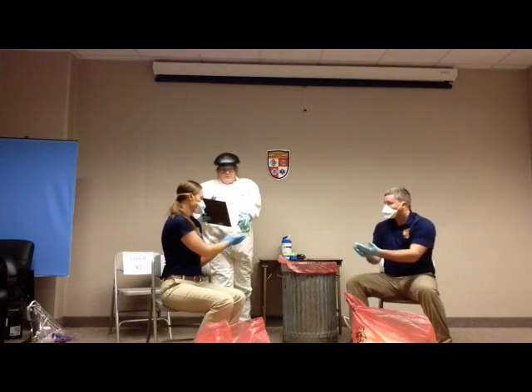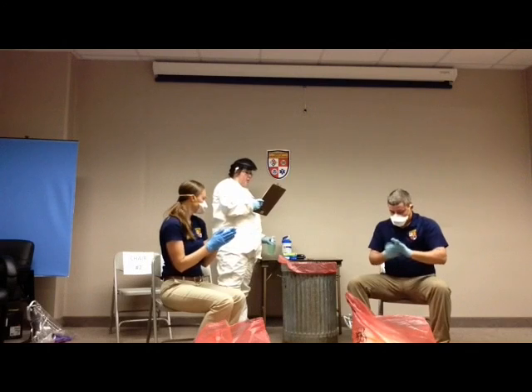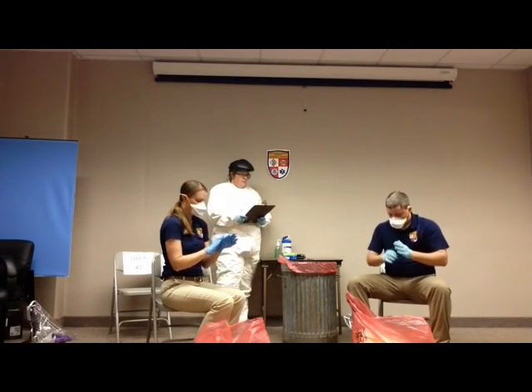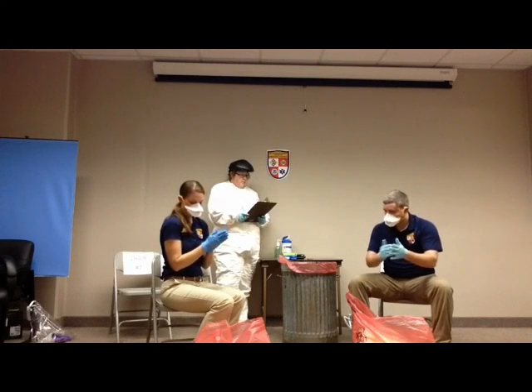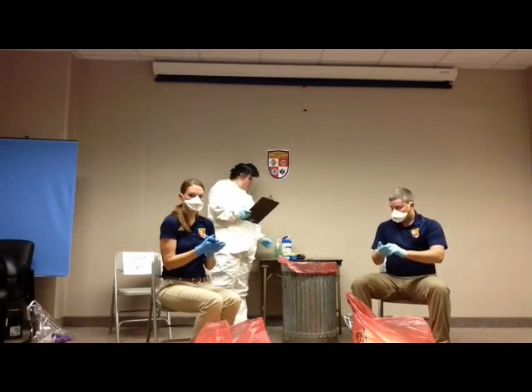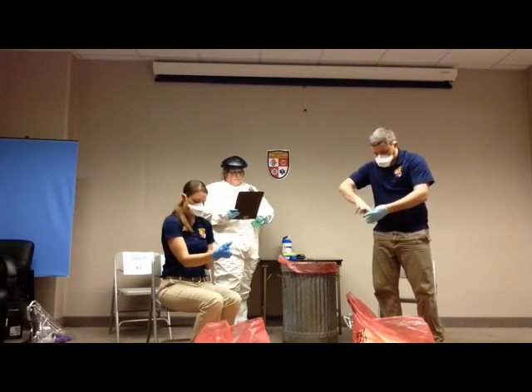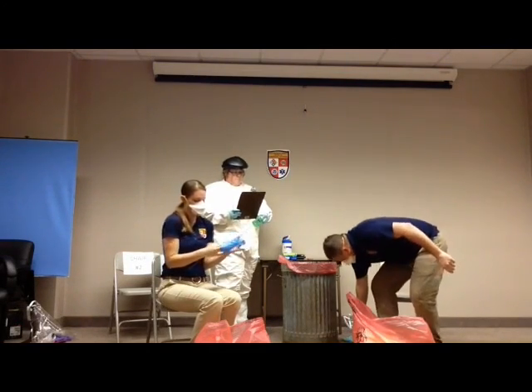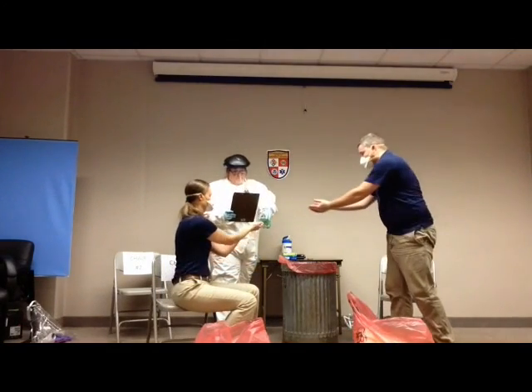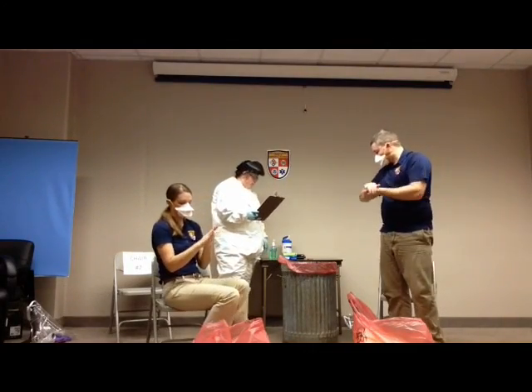Inspect and disinfect gloves. Trained observer, if assisting with removal of coverall, must complete this step. Remove inner gloves and disinfect hands with alcohol-based hand sanitizer. Don a new pair of gloves.